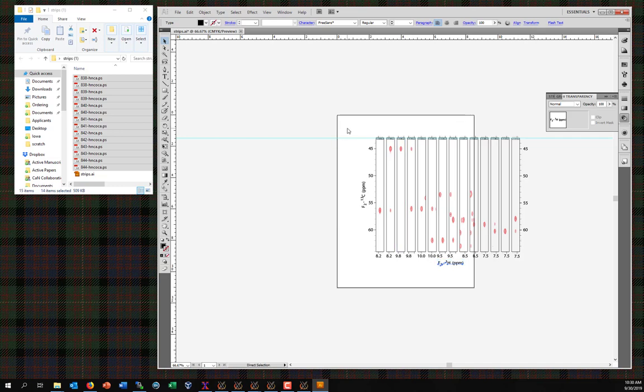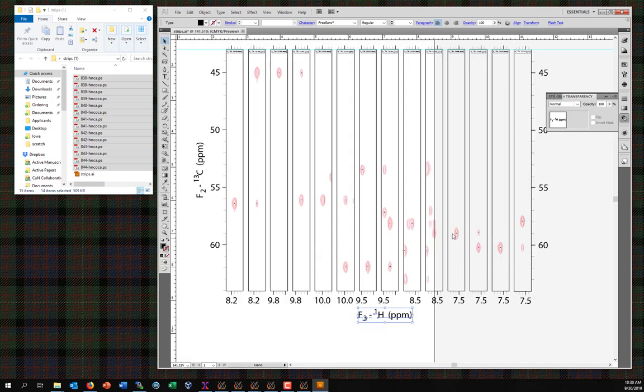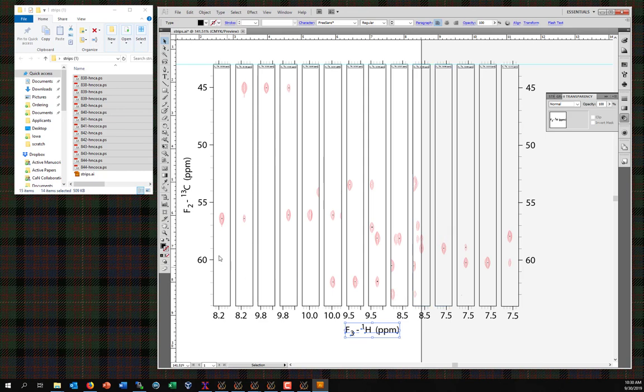The next question becomes, let's try to get this sort of nice. There's a couple of things that we still need to do. We need to put our nitrogen chemical shifts up here at the top, possibly with a label of what residues are which. That's easy enough to do. But just to show you some features here, before we wrap up, I want to try to keep this video less than an hour.